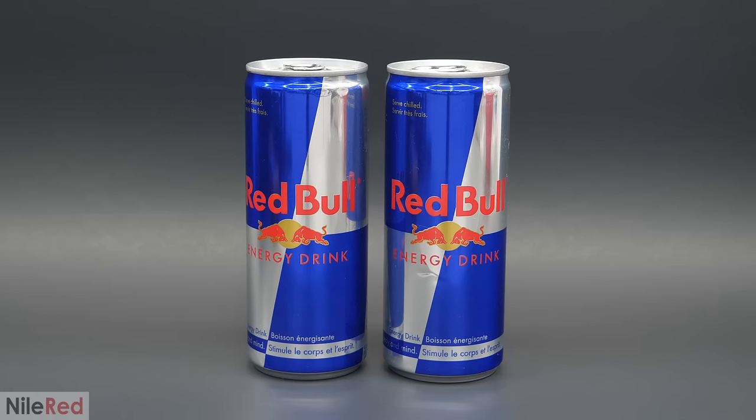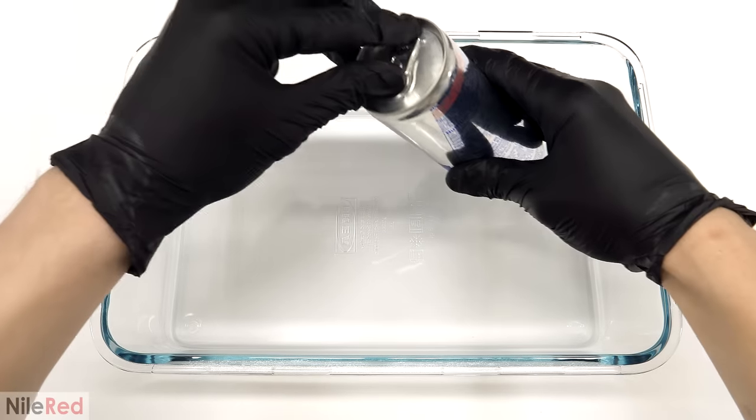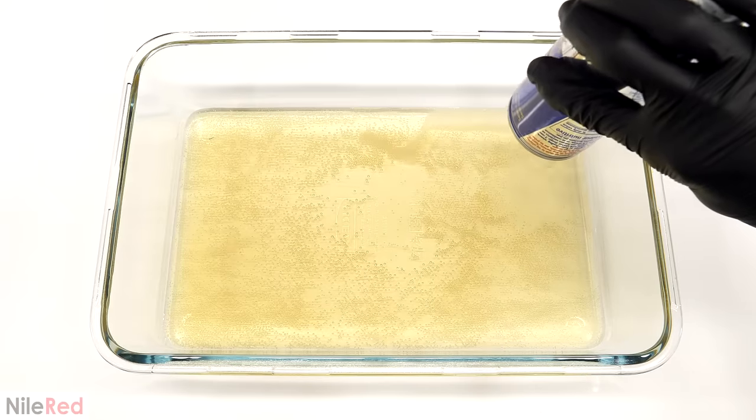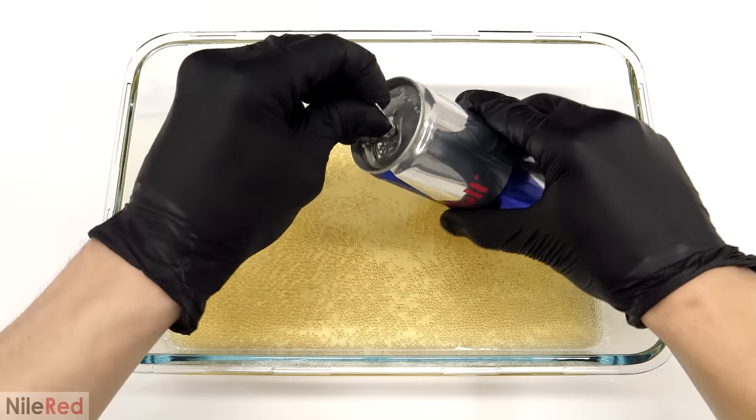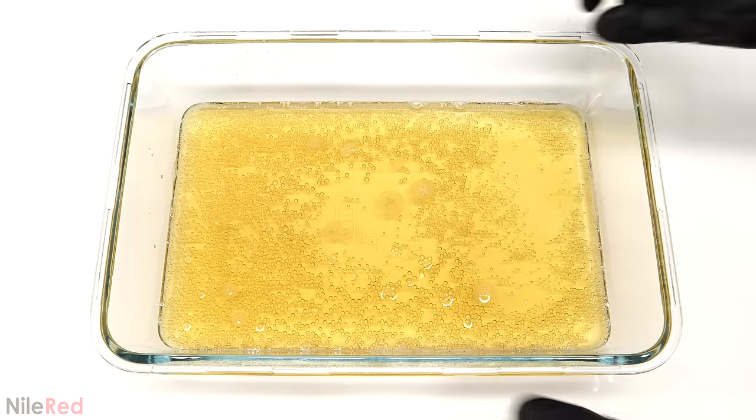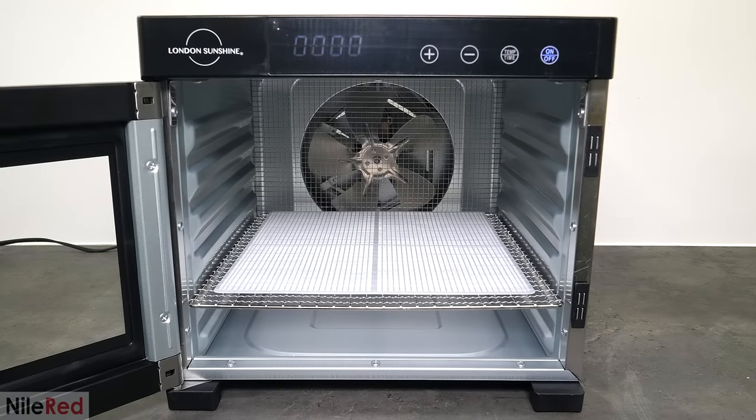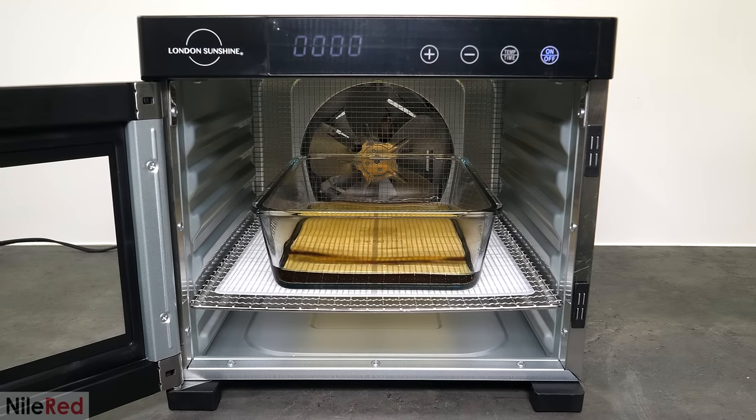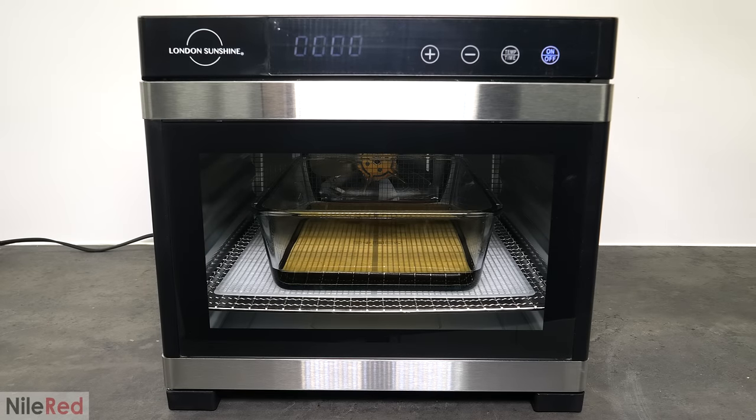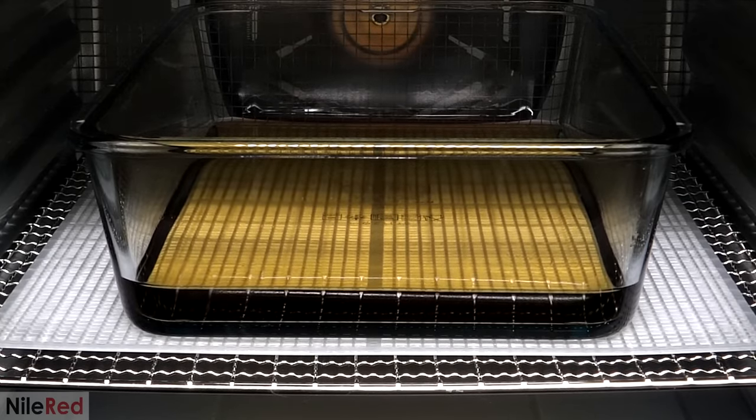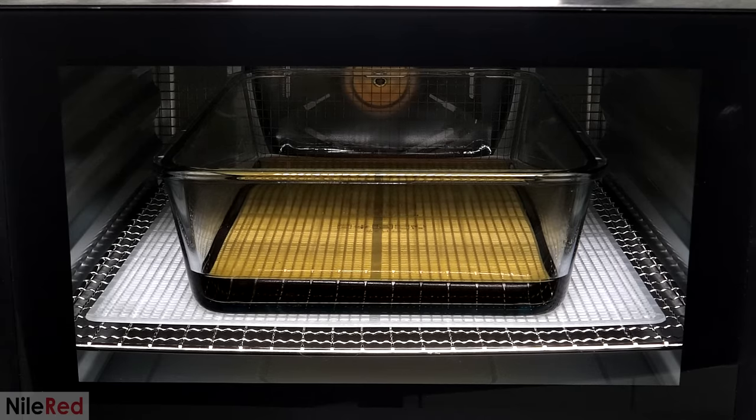To get this all started, I got a couple cans of Red Bull, and I emptied them into a dish. Then after that, I put it into a food desiccator that's normally meant to dry things, like fruits and vegetables. What I was trying to do here was get rid of most of the water to reduce the scale that I had to work on. This would just make things easier in general, and it would let me use less solvent for the extraction. At the same time, it would also get rid of all the carbonation, which would have made the extraction absolutely impossible.